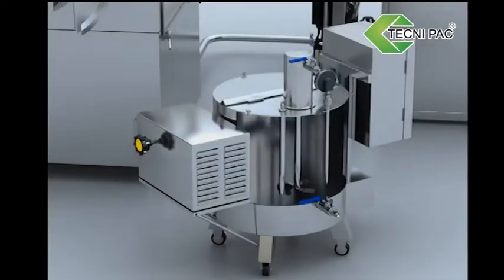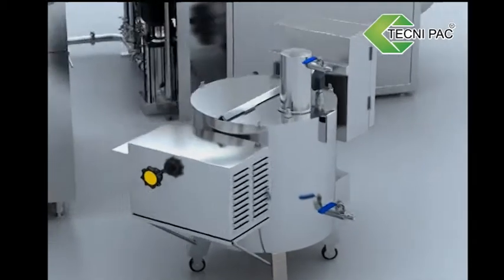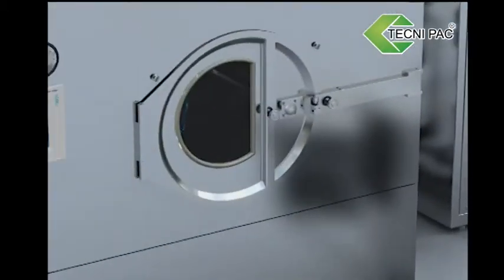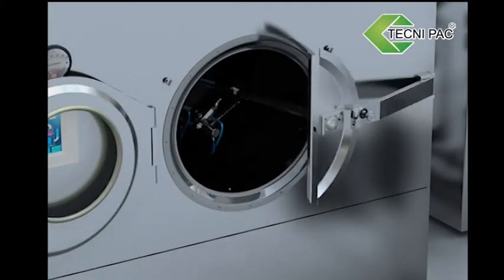Sprayed Syrup and Atomized Syrup System. Many have electric heating, agitating tank, constant variable, peristaltic pump, and spray gun assembly.